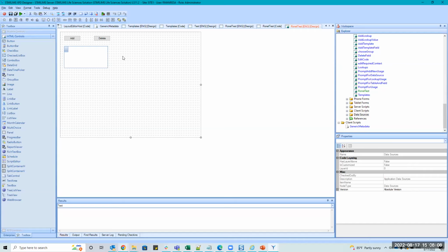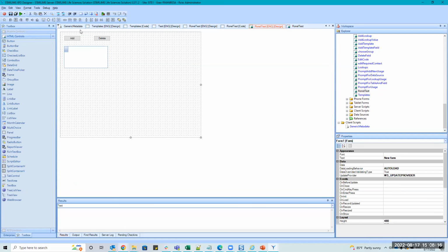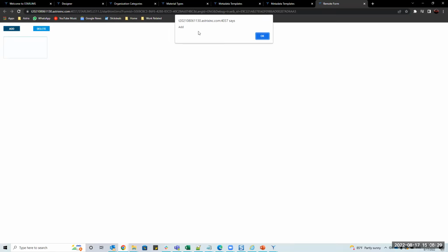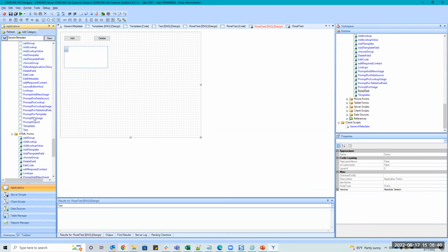But guess what? This is the new form. There's the same code. Nothing had to be changed here. And I can run it. And now it's going to run in Chrome as an HTML5 and JavaScript application. And then there's the two buttons, right? And that's what the alert looks like. So again, very nice, right? With this conversion. And everything went through this process. That's why we have one-to-one here. So any questions on this conversion or XFD versus HTML?